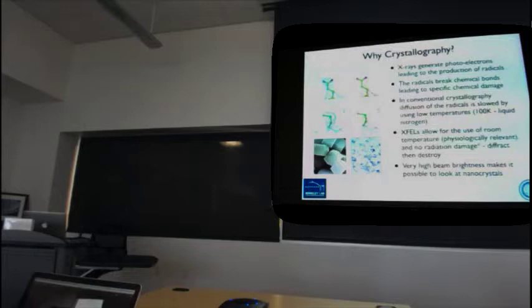And these are crystals on the submicron scale, very thin membrane protein crystals that can actually be used in an FEL experiment. So these are all things that traditionally have been difficult to do with synchrotrons. I think some of the advances that we're going to see in synchrotron sources, such as diffraction-limited rings, may make some of these things possible with synchrotrons, although outrunning the radiation damage is not really a feasible thing to do.